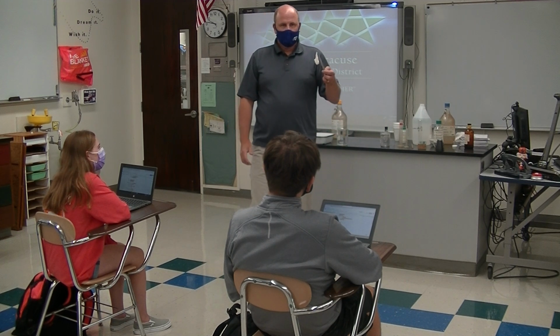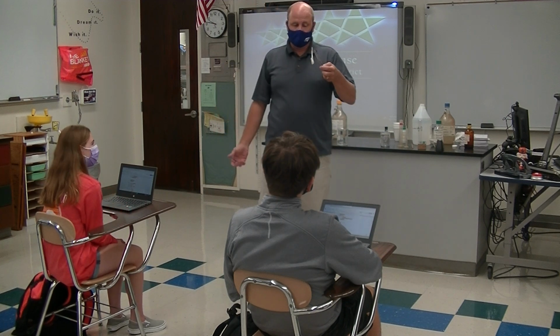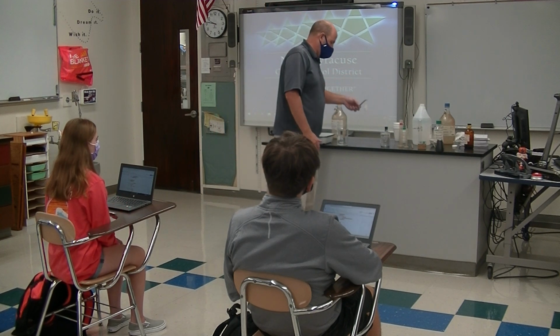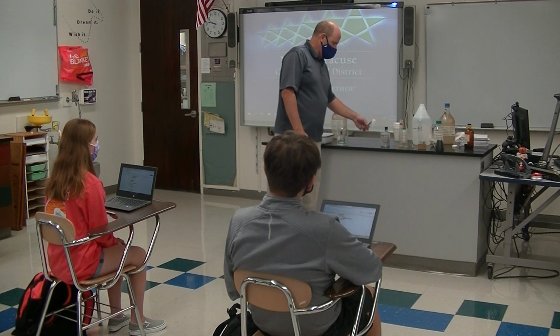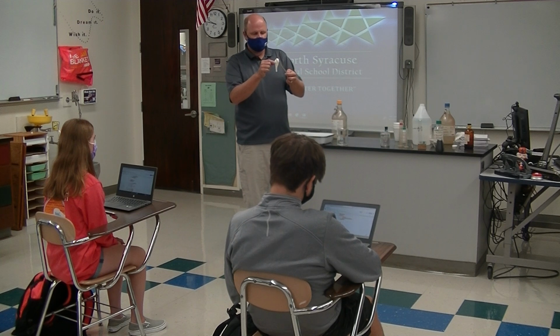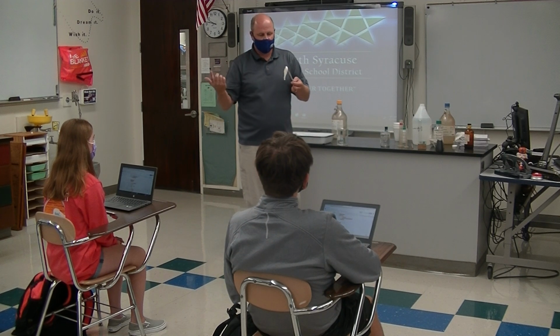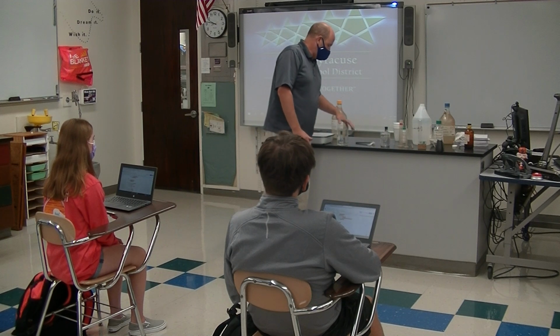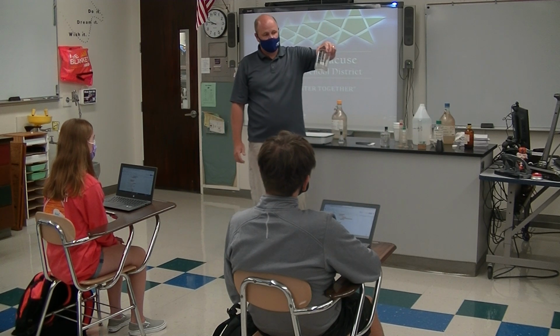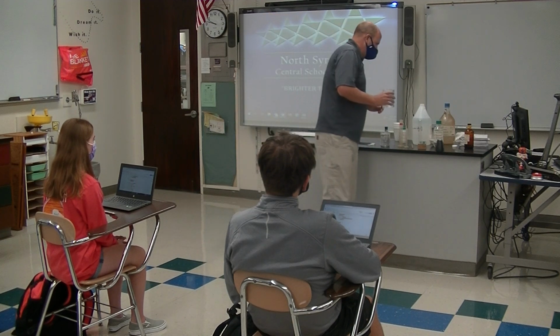All right? The substance that I use to do this is something you could run into at home, and that's why I say at home stuff is important as well. I can't really pass it around to you guys because you can't touch from one person to another. I used to be able to do that. But I want somebody to identify this smell. This has got another odor, so we're going to waft this carefully. Who wants to identify this one?